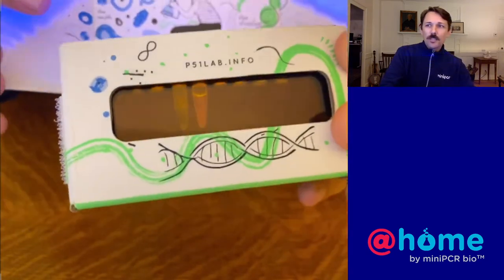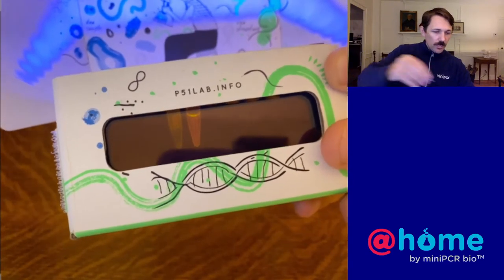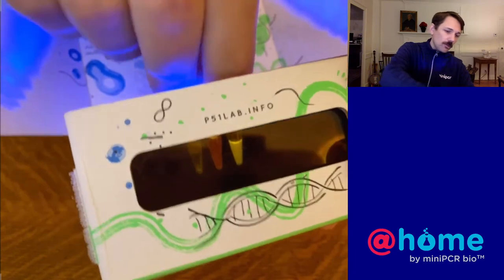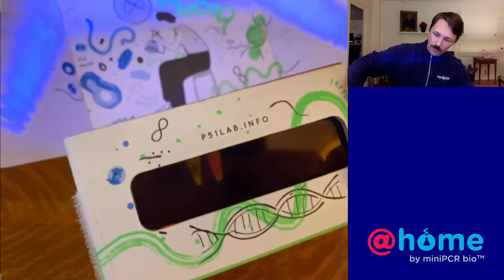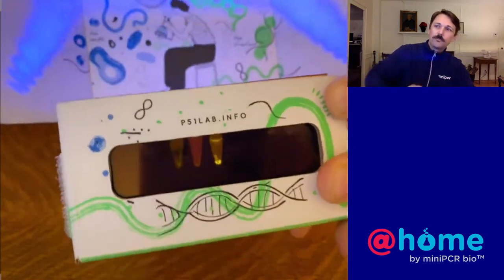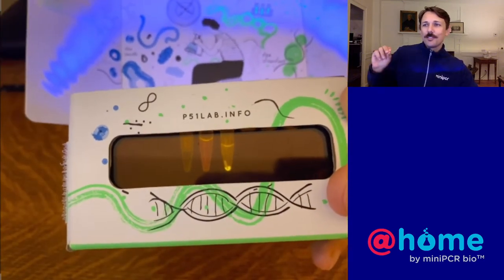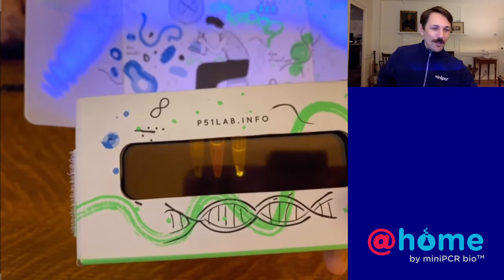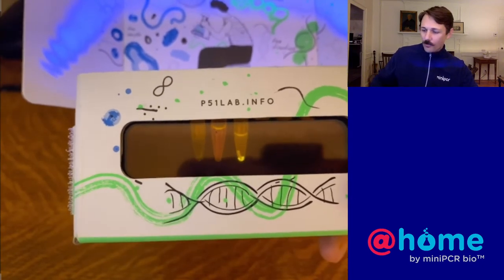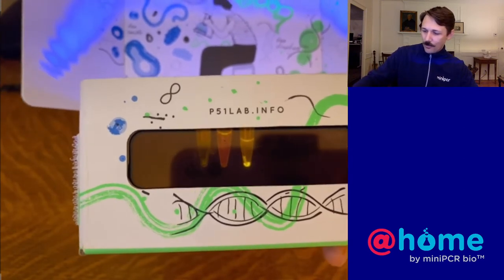So I had a more expensive olive oil. It was like a dipping olive oil for eating with bread. And so I said, well, I bet that one will fluoresce really brightly, so let me try it. Oh, that's the wrong tube, actually. This is the one I'm looking for. And whoa, look at that. So the interesting thing here is almost all that fluorescence in there comes from this little dot in the bottom. That dot in the bottom is an herb that was mixed into the olive oil. What I thought was my expensive dipping olive oil, when I looked at the ingredients, it's actually like half canola oil. So that kind of was disappointing.